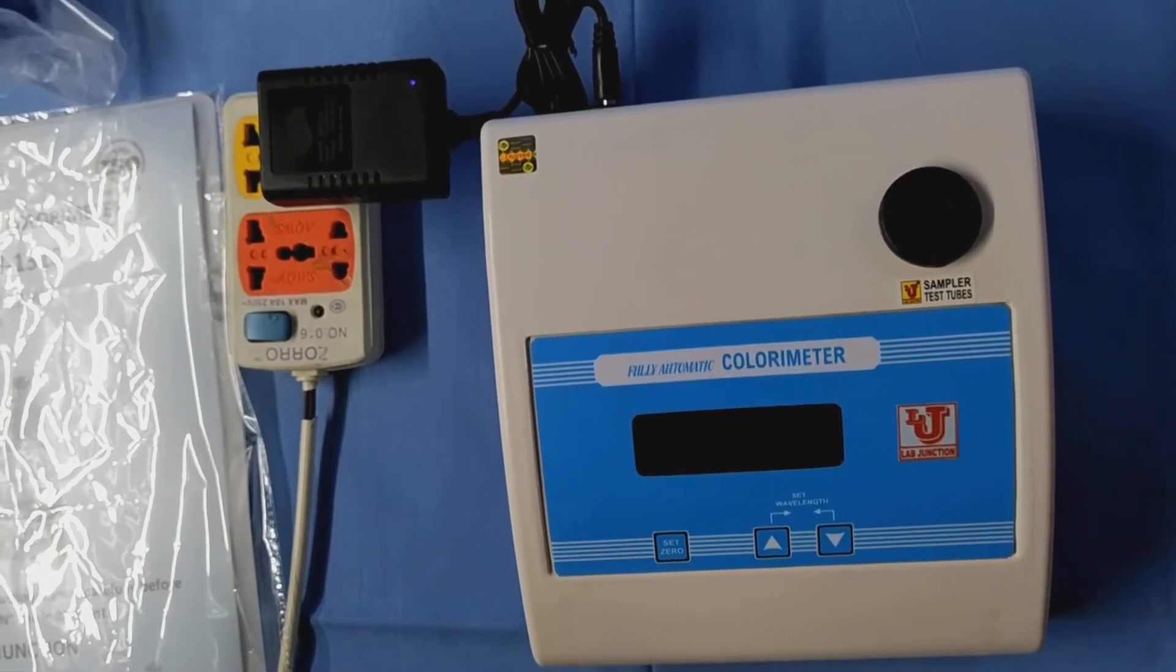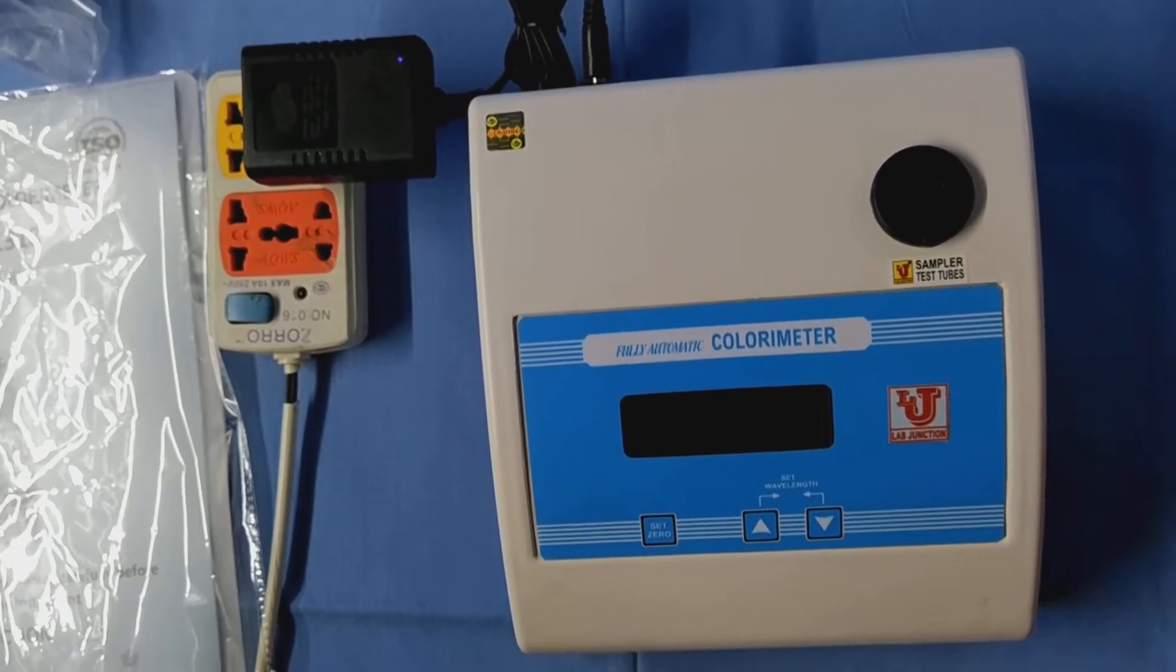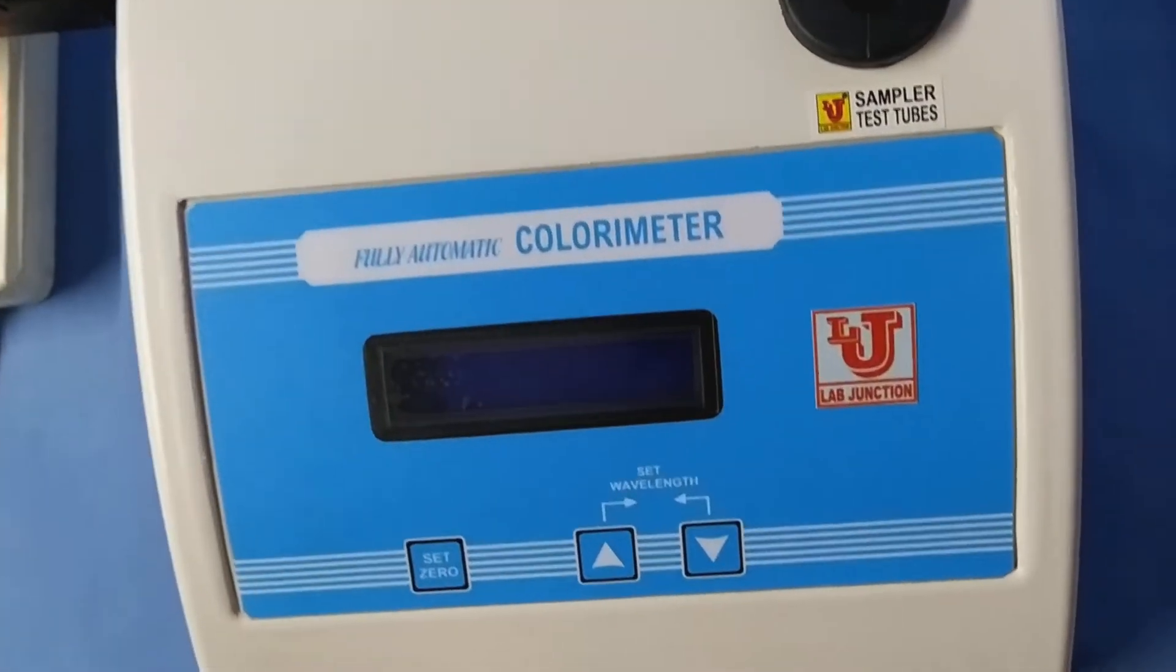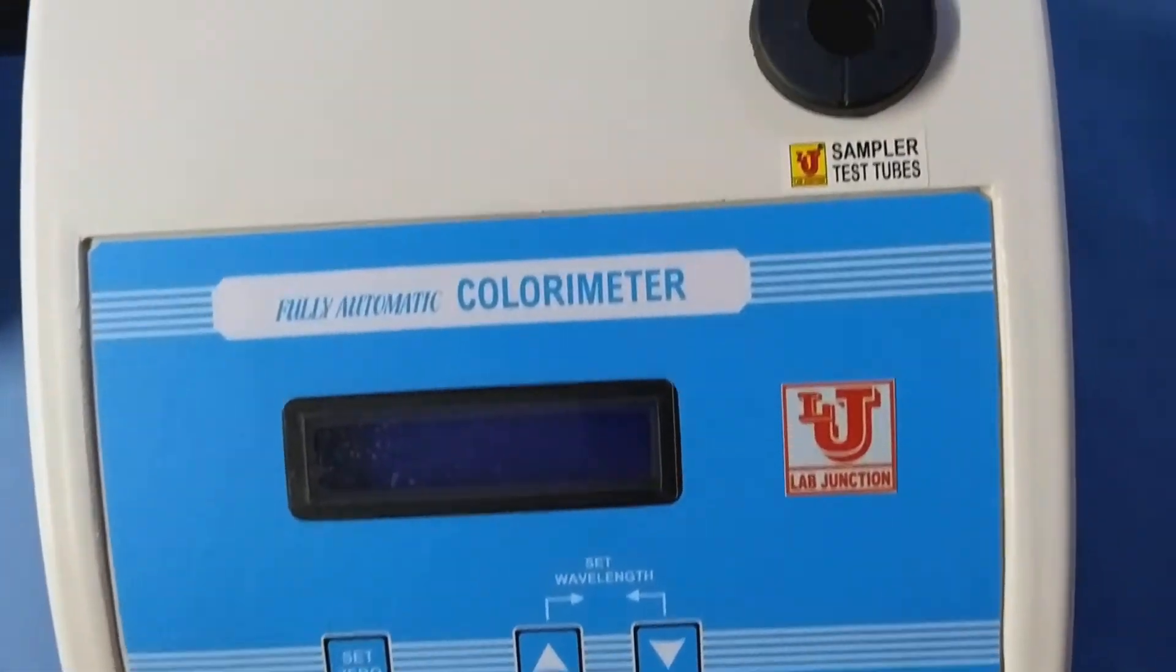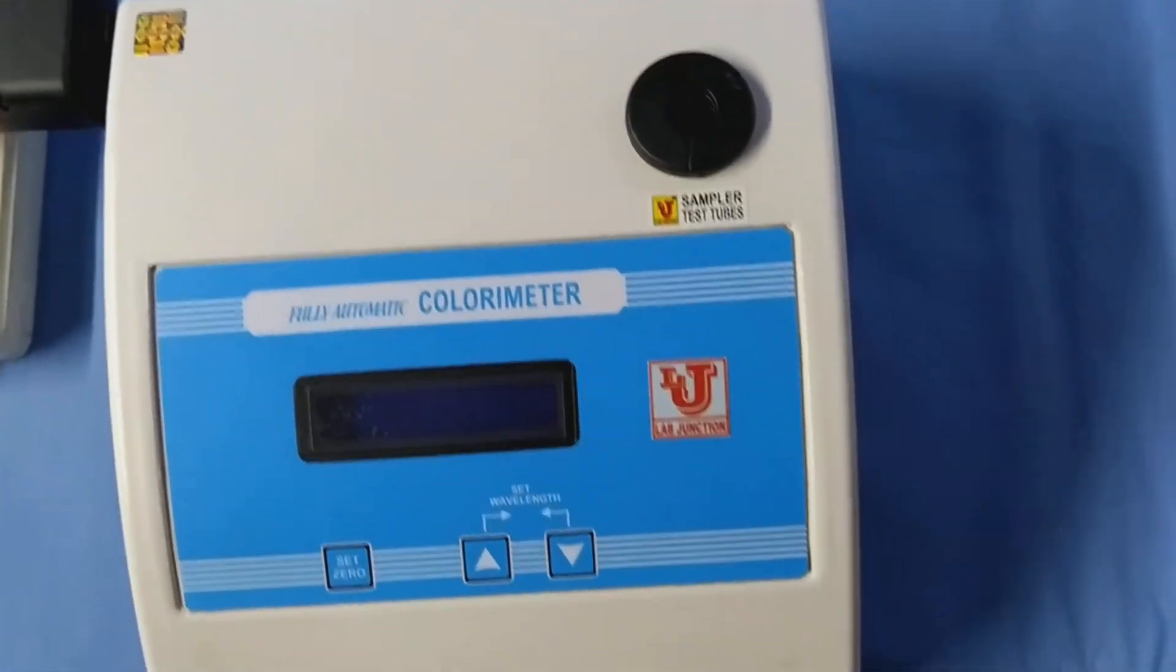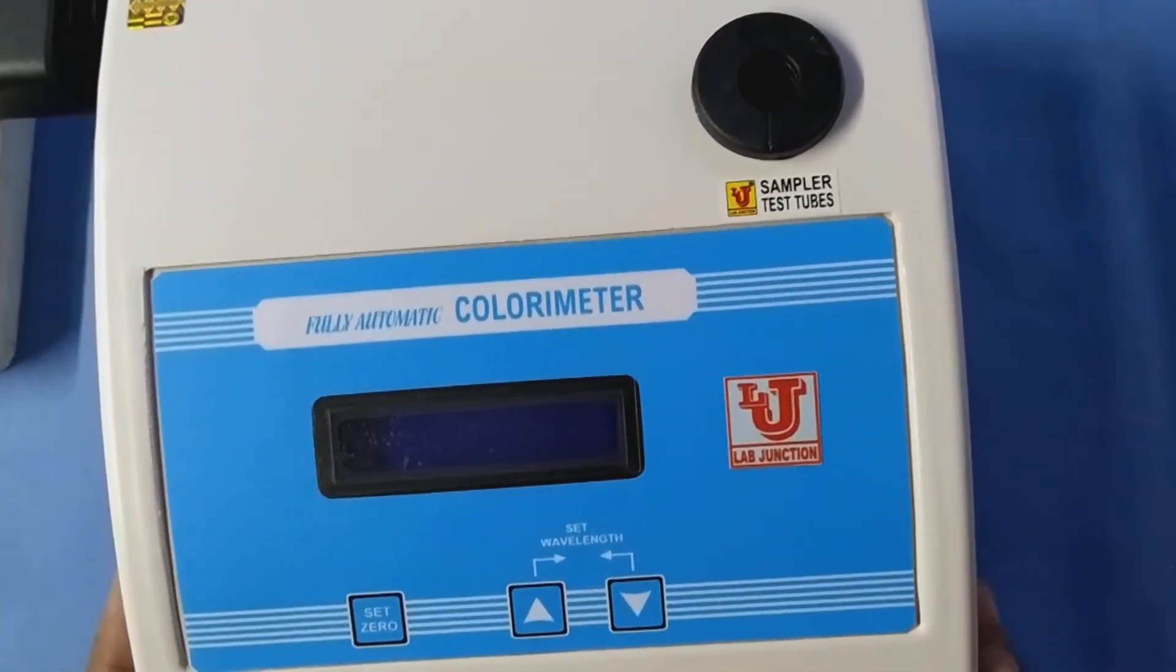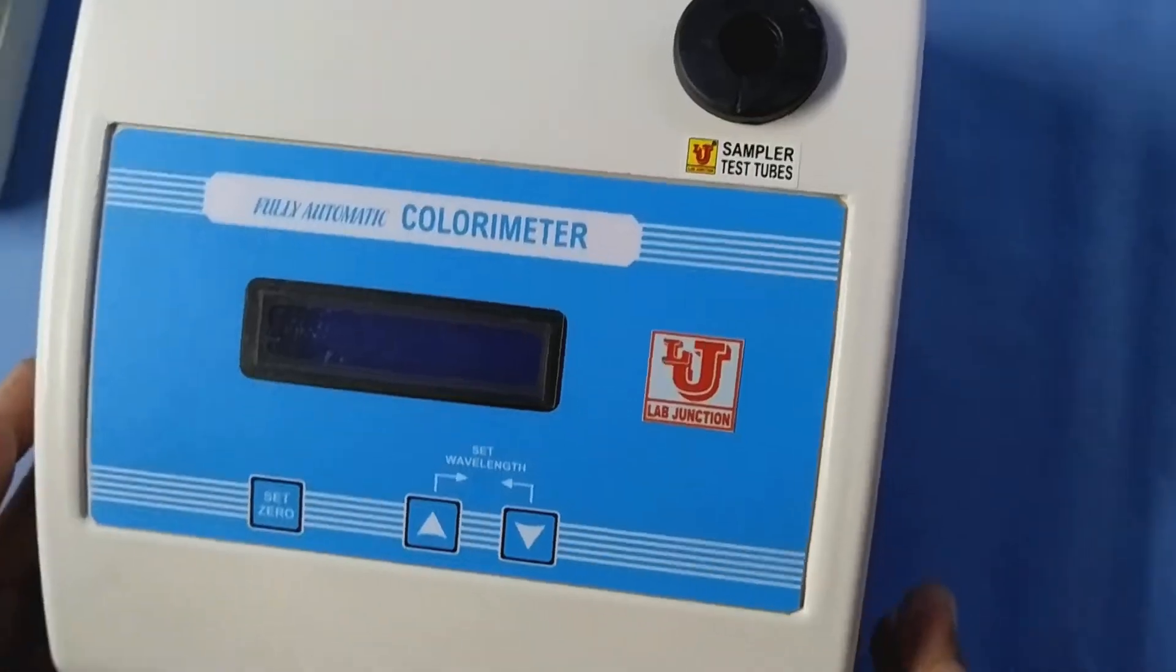Lab Junction's Fully Automatic Colorimeter Model LJ1318. This colorimeter has 9 filters. This is our main instrument. These are the front view and side views.